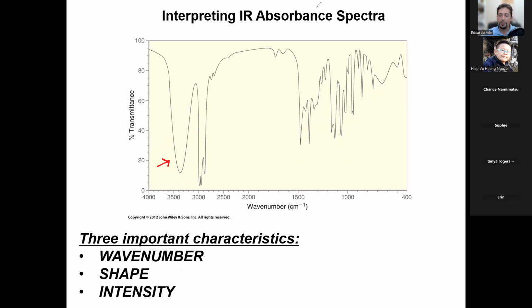Okay, so Brandon said broad. Good, right? That seems like a pretty broad peak. It's not very sharp, so it would be broad. Is it strong? Is it weak? Yeah, strong, broad, right? Strong, broad peak. This is how we talk about the peaks. We use these words to describe the shape of the peak: strong, broad, weak, medium. We call that intensity, if it's strong or weak. We call it broad or narrow, depending on the range of the wave numbers. Yep, you guys are right on the chat. So we look at the shape and we look at the intensity.